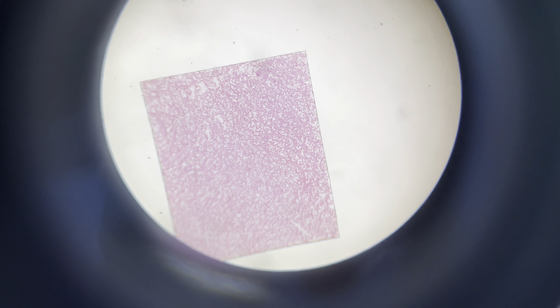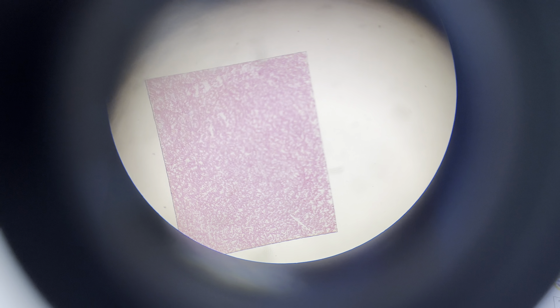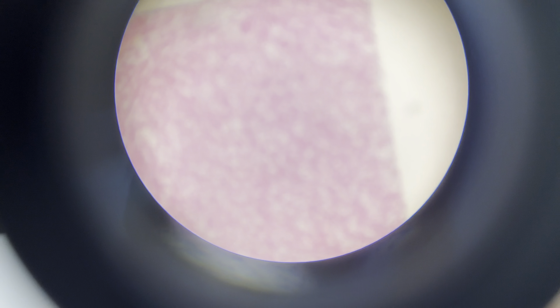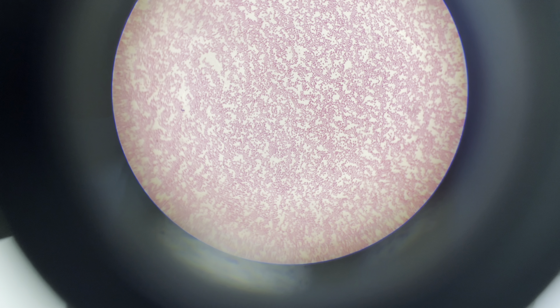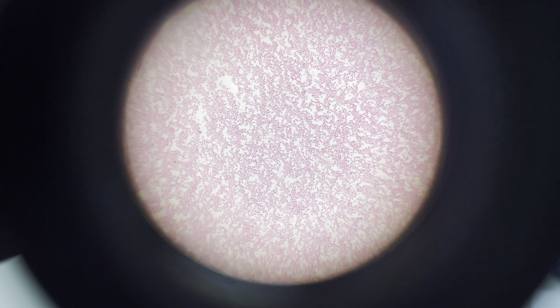Continue with the subsequent objective lenses and find focus each time. Right now we are using the red objective, or the scanner, with 4 times magnification. Then we are going to switch to the low power objective with 10 times magnification. We are going to use the fine adjustment knob to refocus so we can see the specimen clearly.